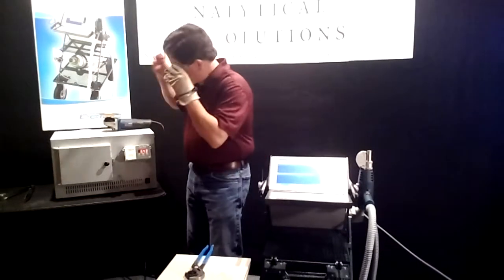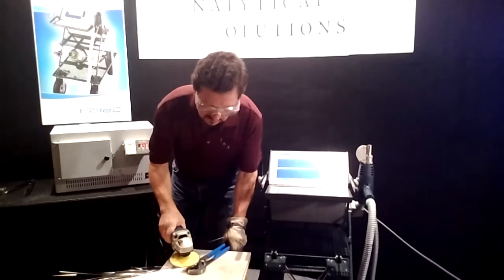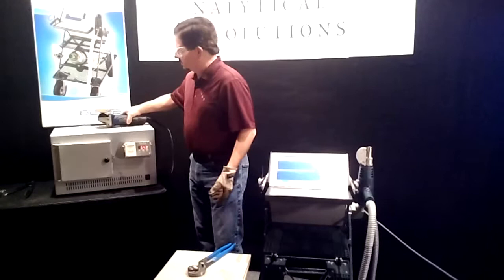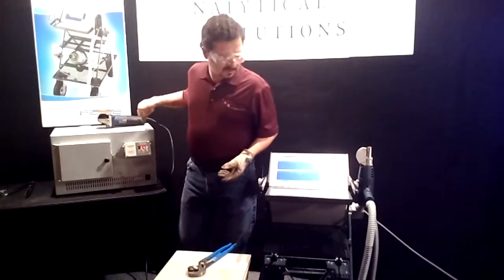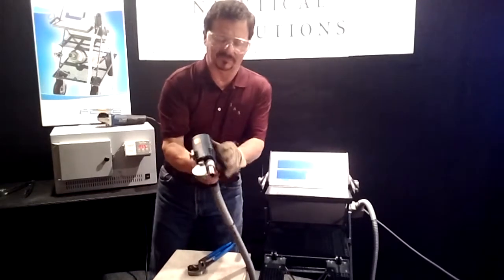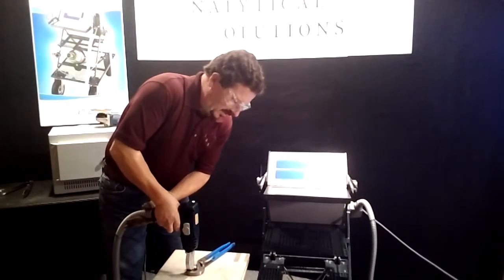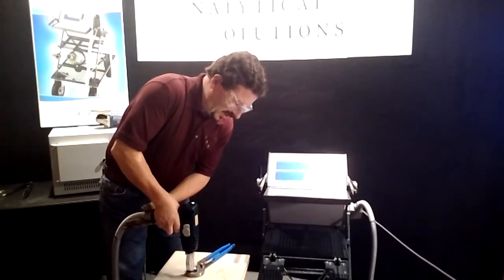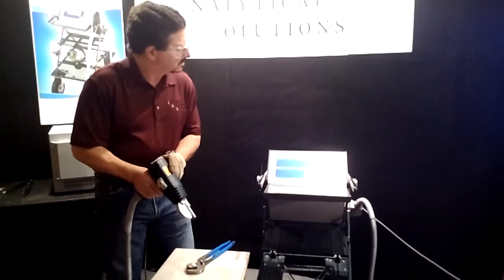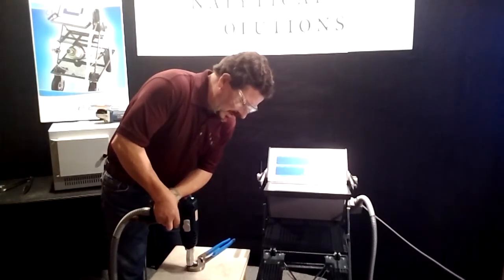Safety glasses. The sample must be freshly prepared in order to knock the oxide off, and the technique is to burn the sample 3 times and take the average.